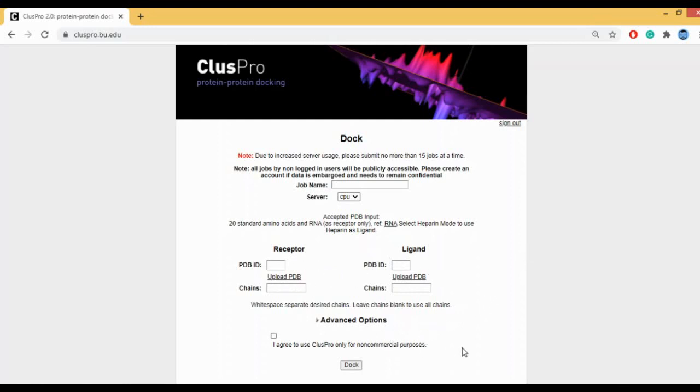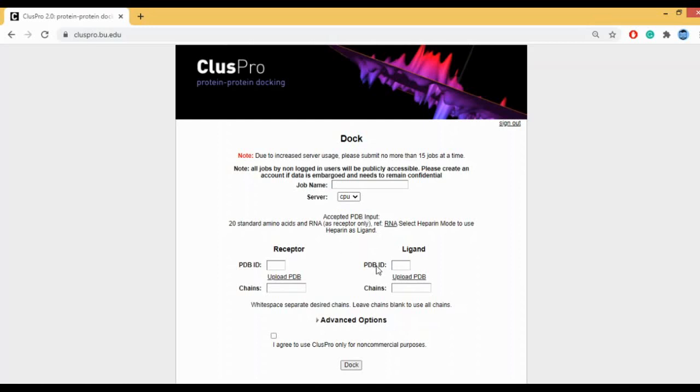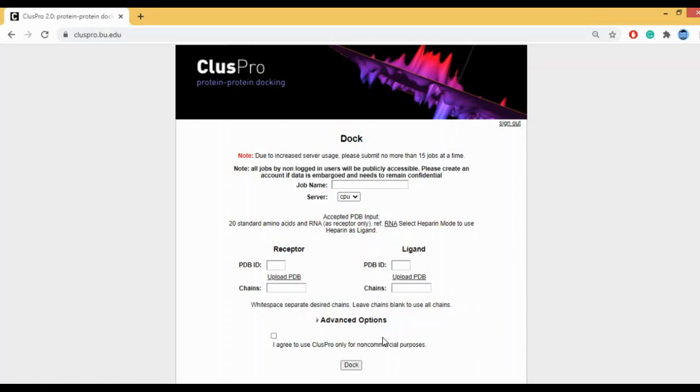The further explanation regarding ClusPro and whatever the further working is, I will be showing you via the PPT because I have taken screenshots of the entire process. The reason for doing so is because if you can see here, it says I agree to use ClusPro only for non-commercial purposes. When you're saying non-commercial, YouTube is a commercial platform.